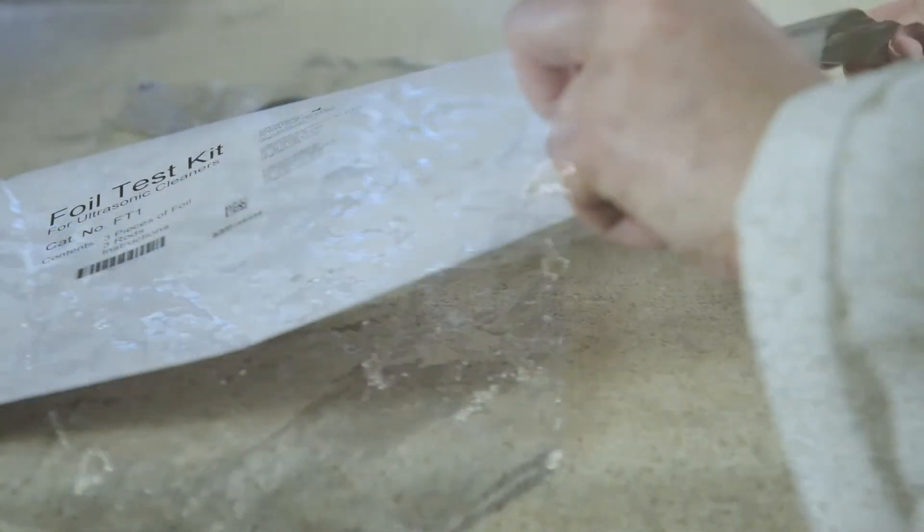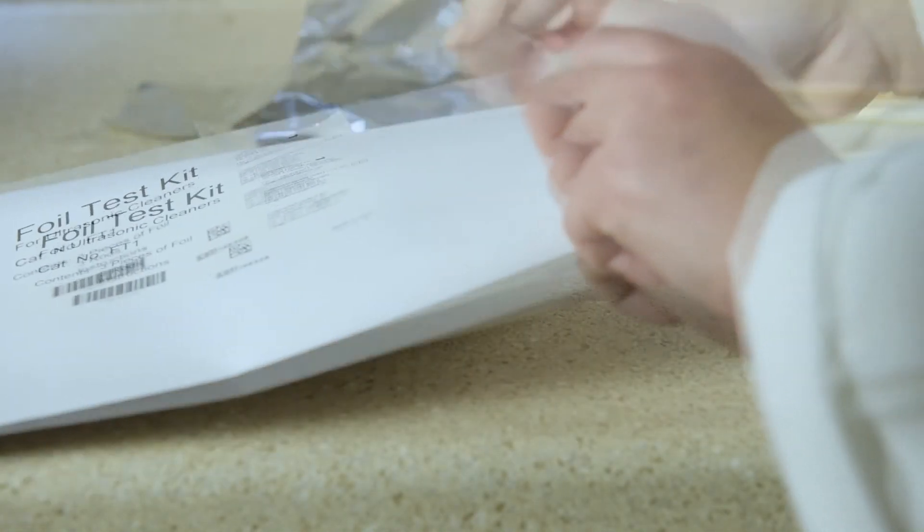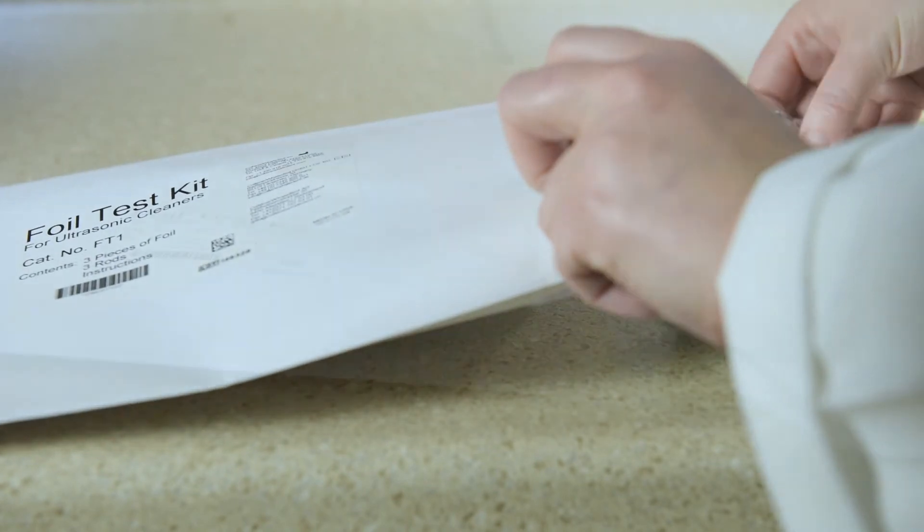Holes should be observed in one or more of the aluminum foil pieces. Date the foil and keep it as a reference for the next time the test is performed.